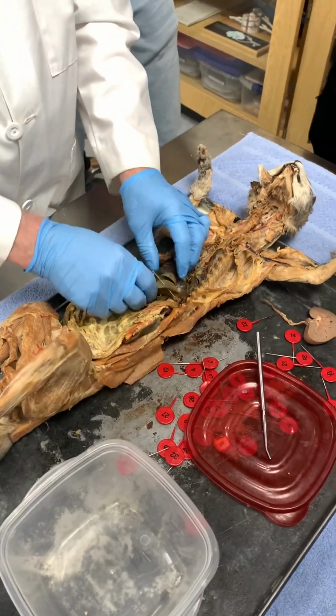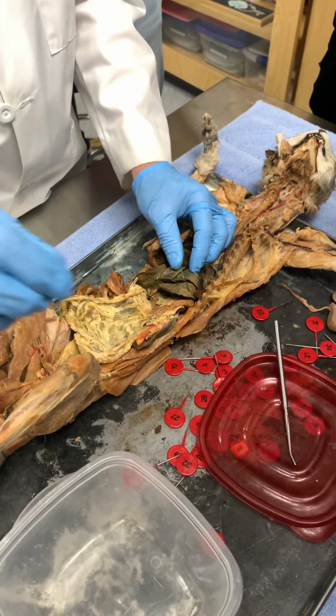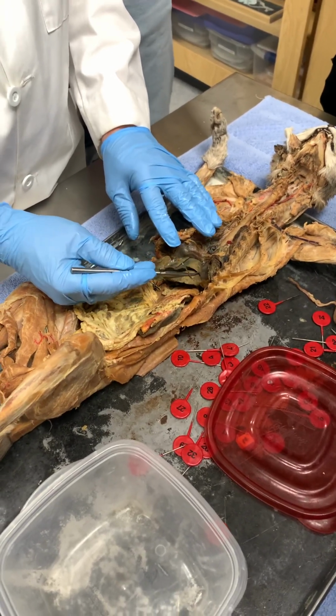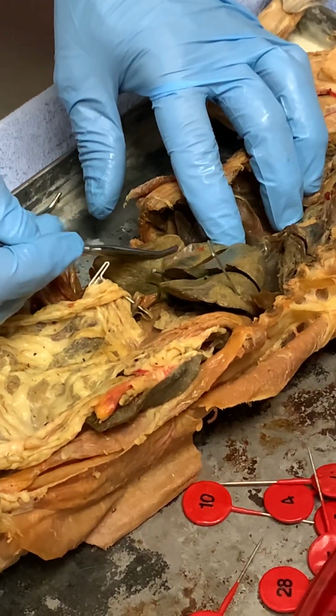Let's start with the liver, because we're going to go in this direction here. So this is the liver. We have the left and right halves. This is the left medial lobe of the liver. This is the right medial lobe of the liver.